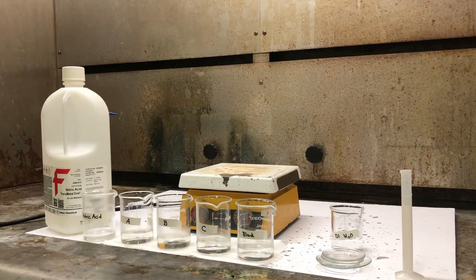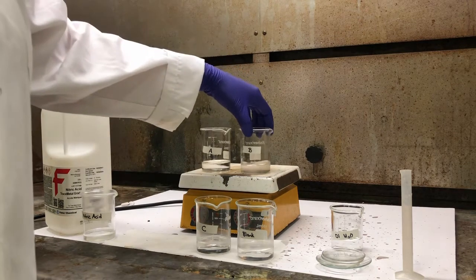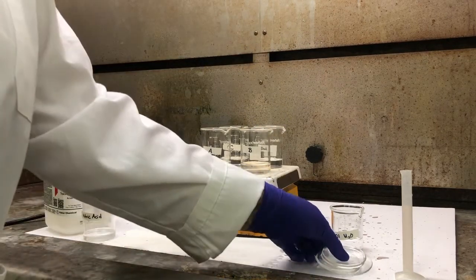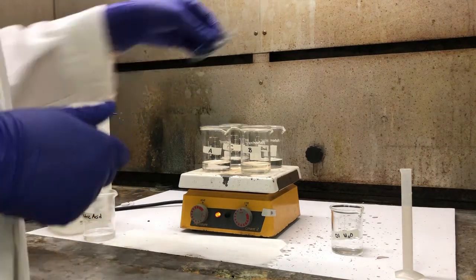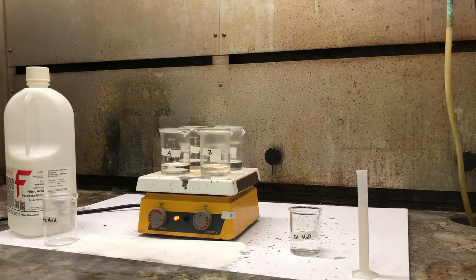Now that we have the water and the acid in each one, we're going to put them on a hot plate all together, our triplicate sample and our blank, and turn them on. We're going to cover them gently with a watch glass, just so that if there's any splashing, we won't lose any of our sample. We're going to heat them until they're just below boiling. We don't want them to actually boil too much. We'll heat them to just below boiling point for about 30 minutes or so until they're all digested.